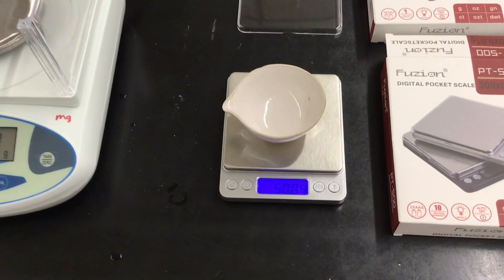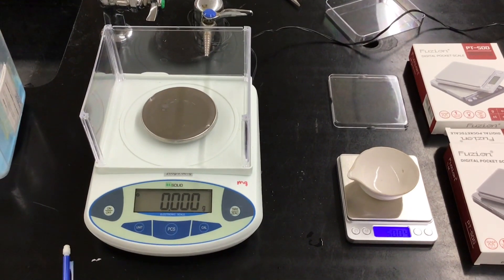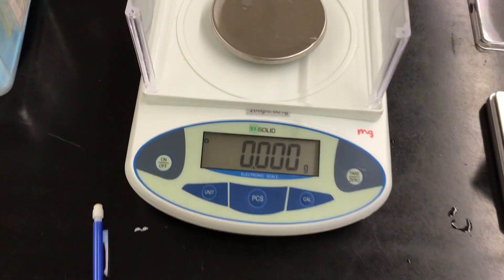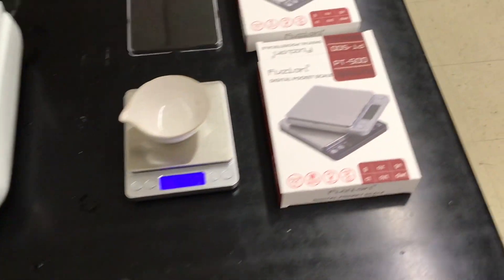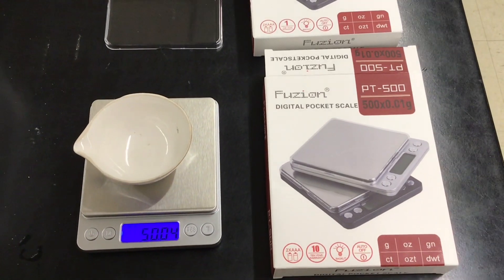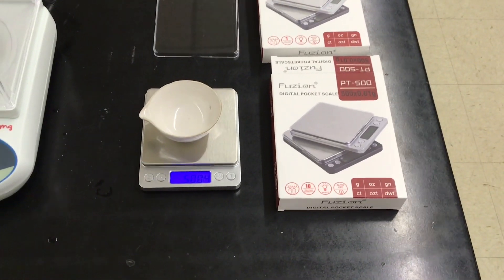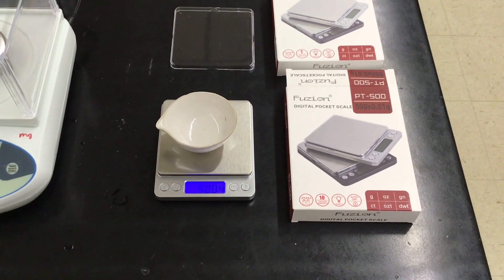I'm going to make a video out of this — a comparison of the previous milligram balances to the new fusion digital pocket scales. I heard about these from the chemistry Facebook group, so I'll make this video and post the data.